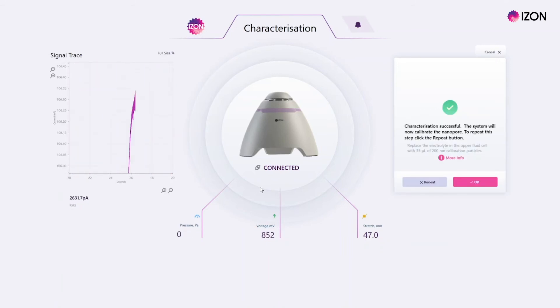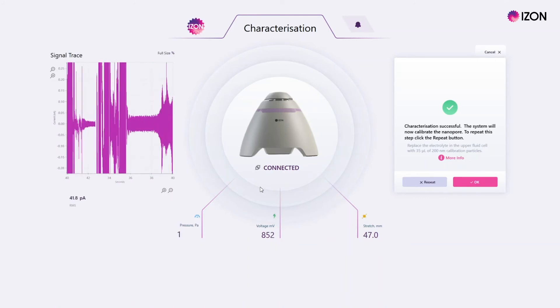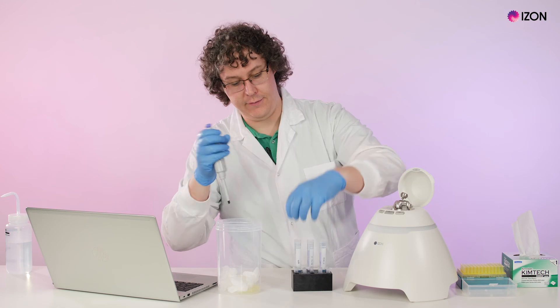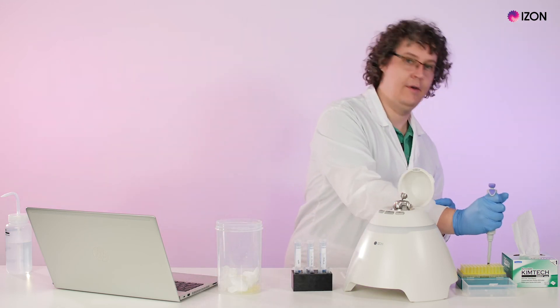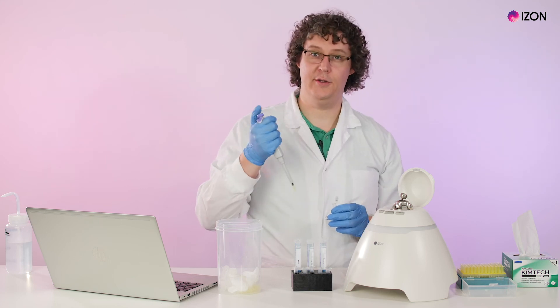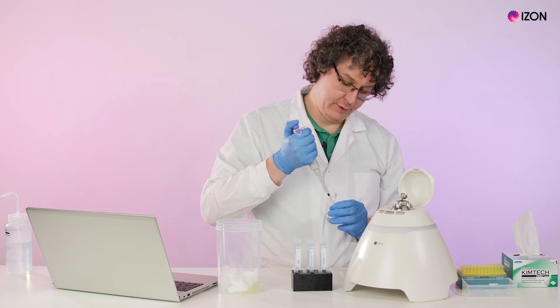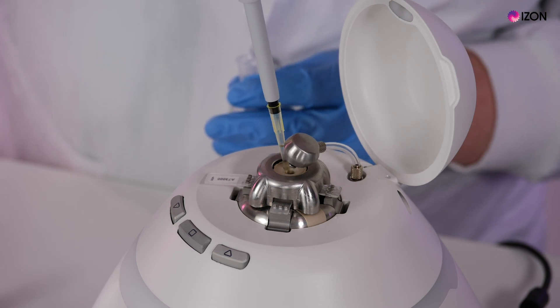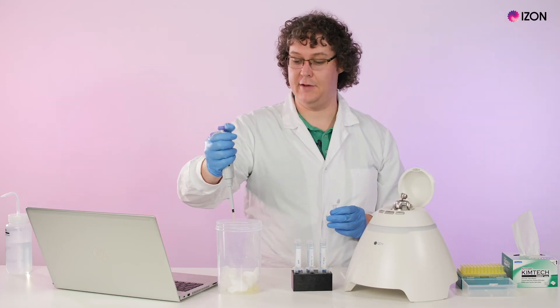The nanopore will then be characterized using calibration particles to complete this process. To do this, replace the measurement electrolyte in the upper fluid cell with 35 microliters of calibration particles. The calibration particles you use will depend on the size of the pore you are using — for this instance, we'll use CPC 200s.